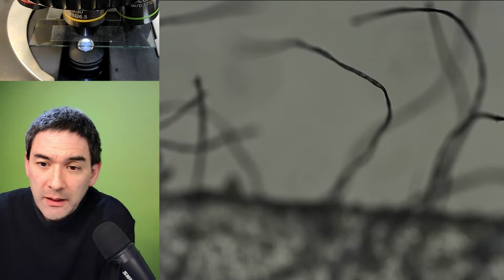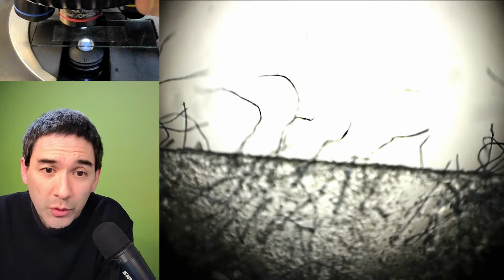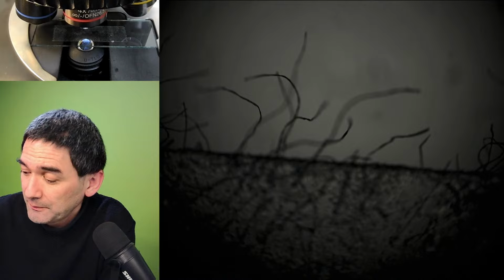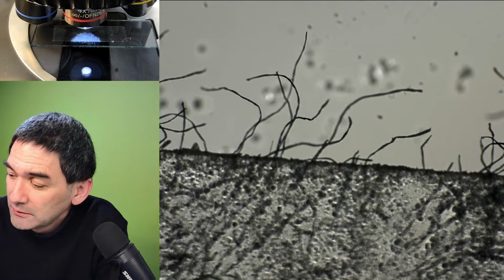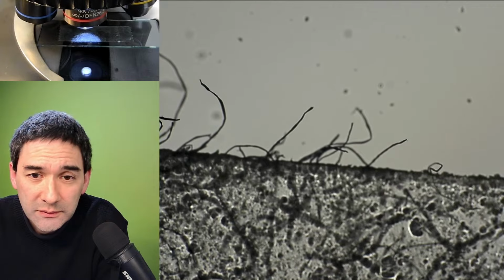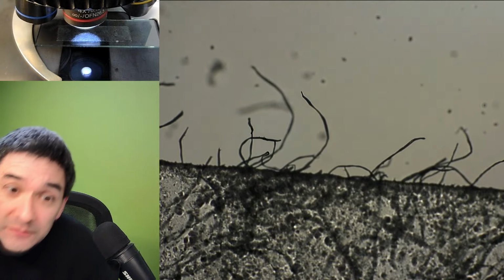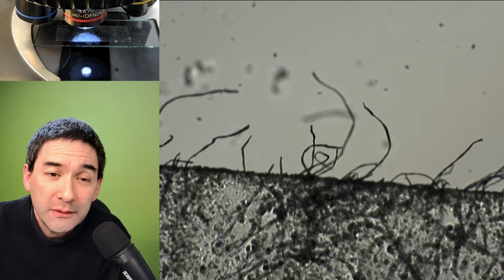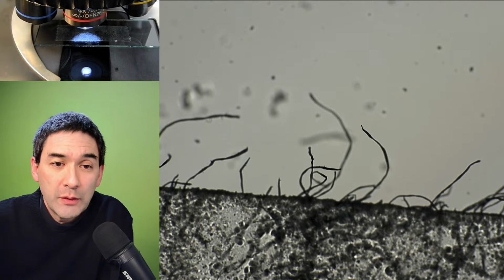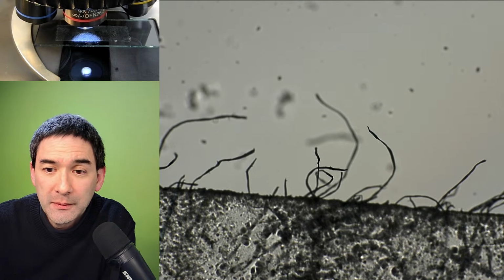And that's it. There's nothing more to that. So let's try it again. Then you have them move around a little bit as they absorb the moisture, and when they dry, they sometimes move back.